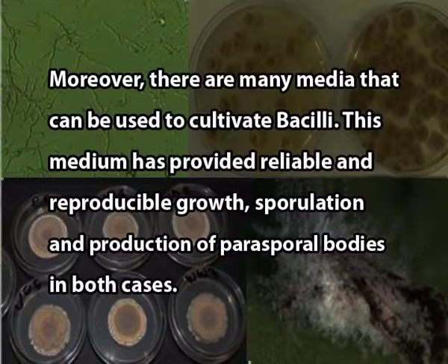This medium has provided reliable and reproducible growth, sporulation, and production of parasporal bodies in both cases. Further, identification of the major groups of bacilli species is made by using identification keys using a minimum of phenotypic characters. For simplification, a key for 22 of the most frequently encountered bacilli species is presented.